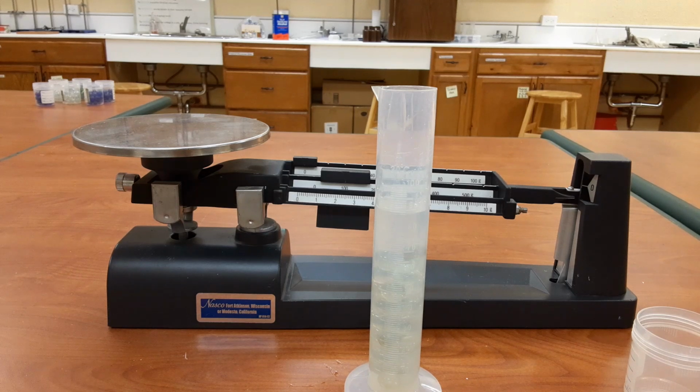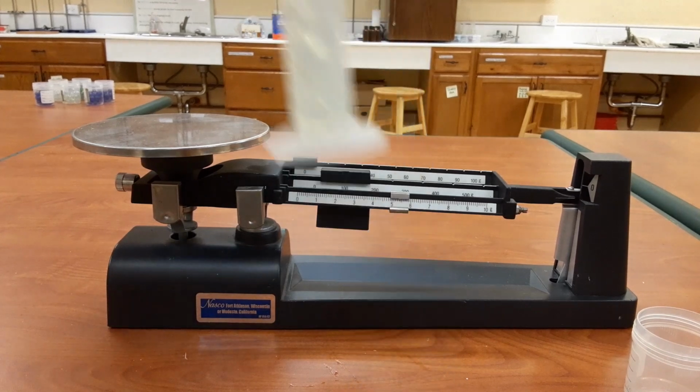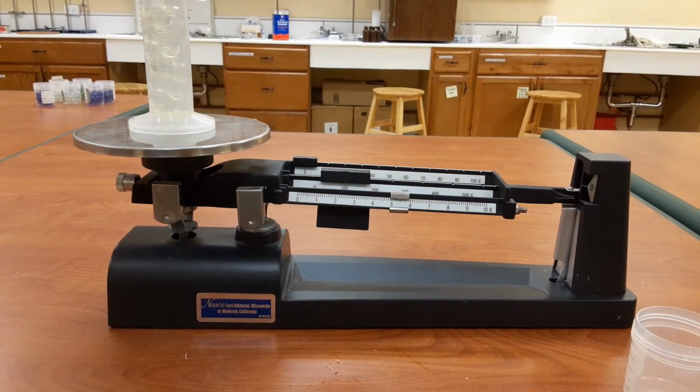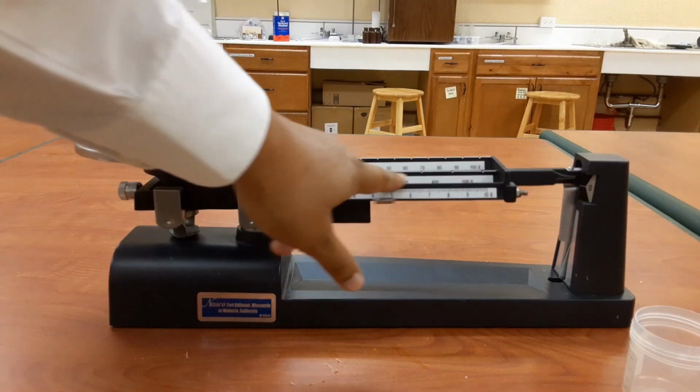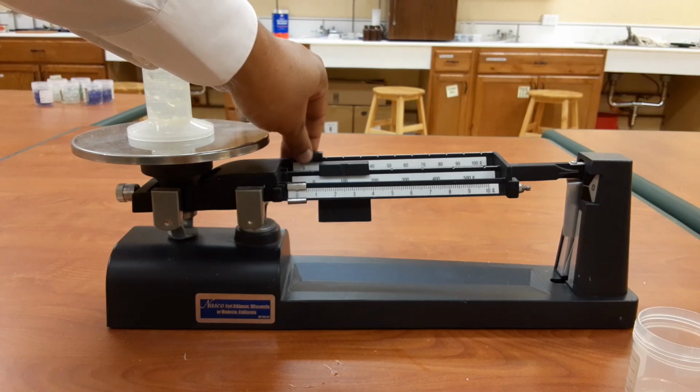So I now have the new volume, and the next thing I need is to find the new mass. So to find the new mass, I'm going to put this graduated cylinder with the water and the marbles back on top of the triple beam balance pan, and then find out what is the new mass.